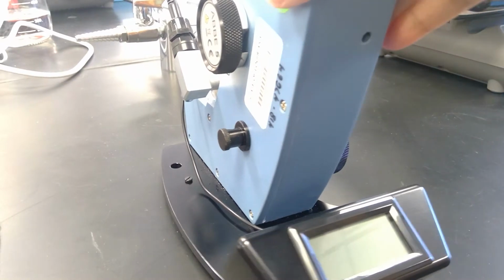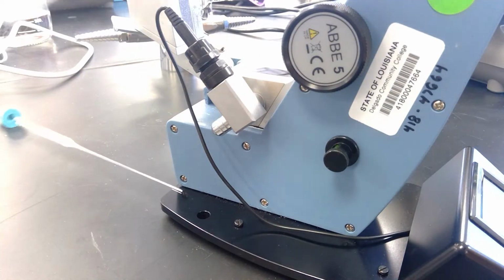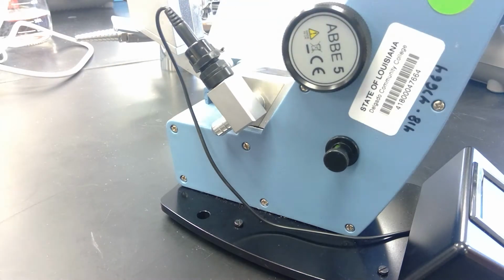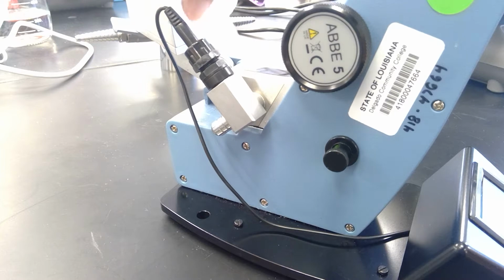So let's go ahead and clean the area. I'm going to turn it so you guys can see. I'm going to take my Chem wipe, and I'm going to wipe the inside where I have to put my sample.